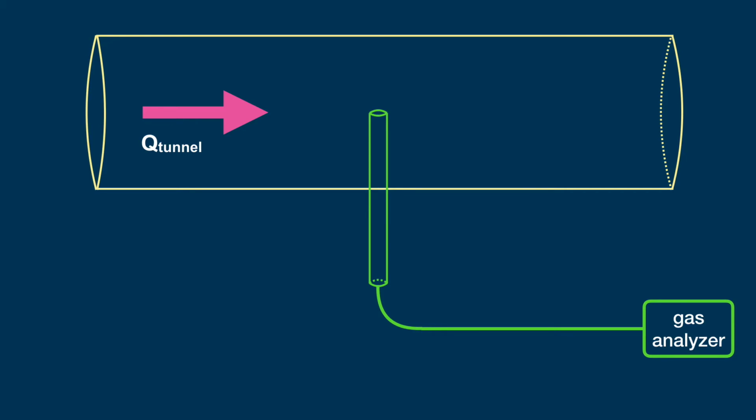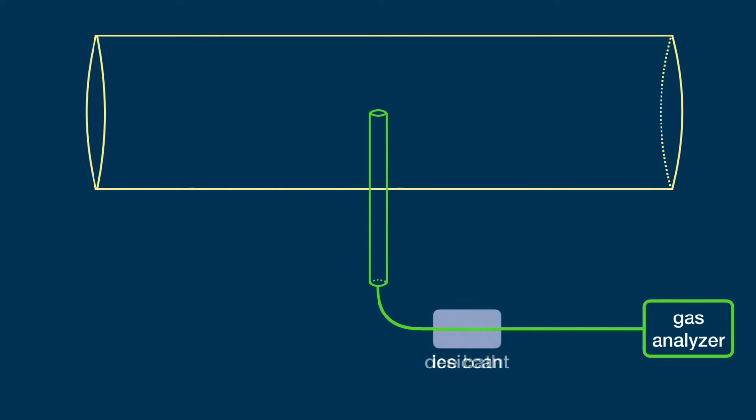However, if your laboratory is located in a very humid climate with high relative humidity, or you are testing a cookstove that generates very high concentrations of water vapor, then you may need to dry the gas sample directly. This can be accomplished using an ice bath to condense water out of the gas sample line, or a desiccant that is non-reactive with carbon monoxide or carbon dioxide.